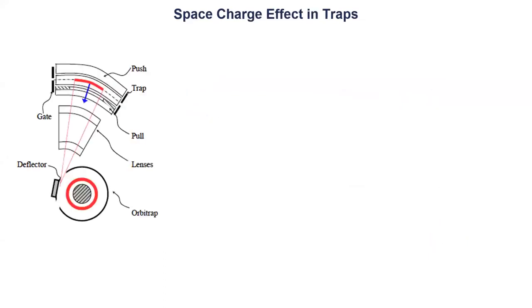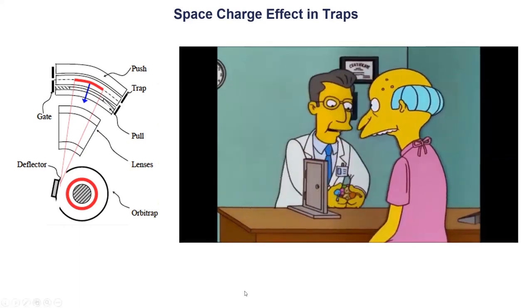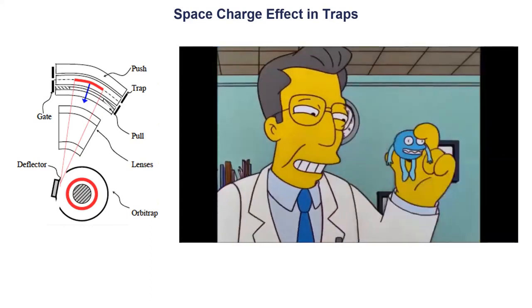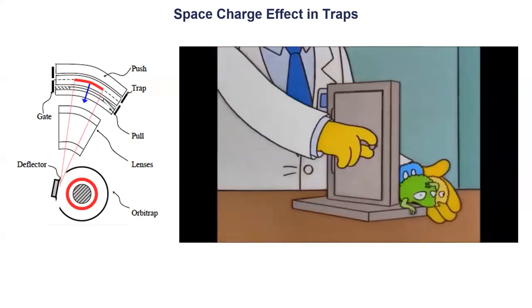And speaking about the C-trap, I already started on what we need to be aware of. If we have a small space and we put all ions into it, we will have a big problem. And this is nicely shown in this video. I know that Daniel, for example, liked this video a lot because it's also highlighting what the problem actually is. So if you have ions, and we try to get them into this little space.